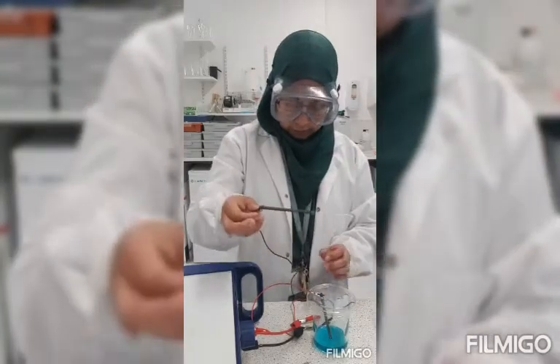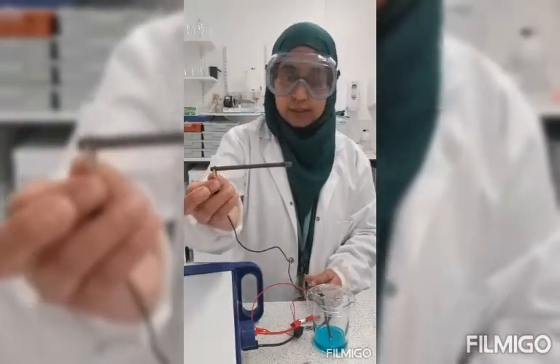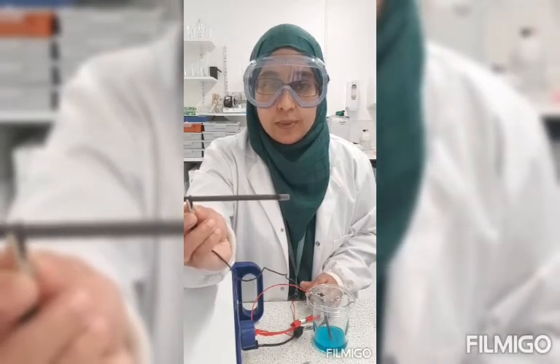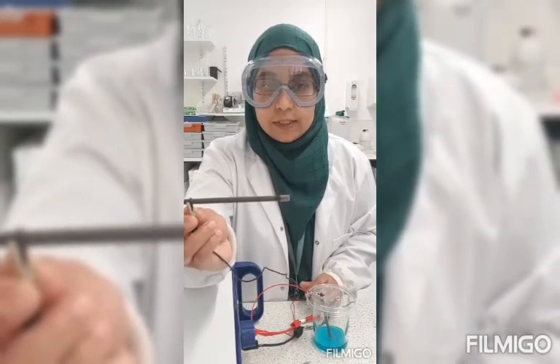Now if I take out the negative electrode, you can see that the colour has changed and a layer of copper has been formed around it.